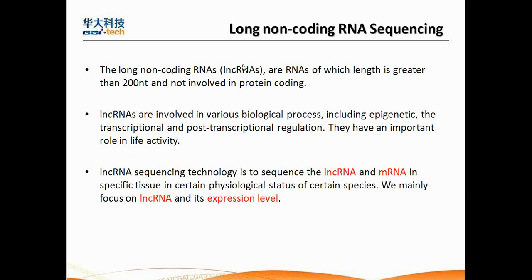Here is another part. This is about long non-coding RNA sequencing. What we were just talking about, small RNA sequencing, the small RNA has a length from 18 to 30 nucleotides, but this long non-coding RNA normally has more than 200 nucleotides in length.